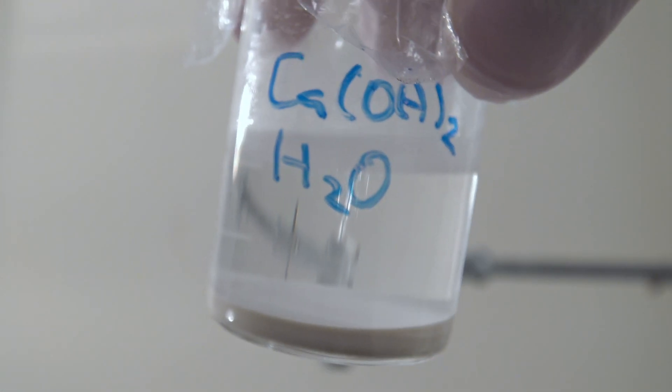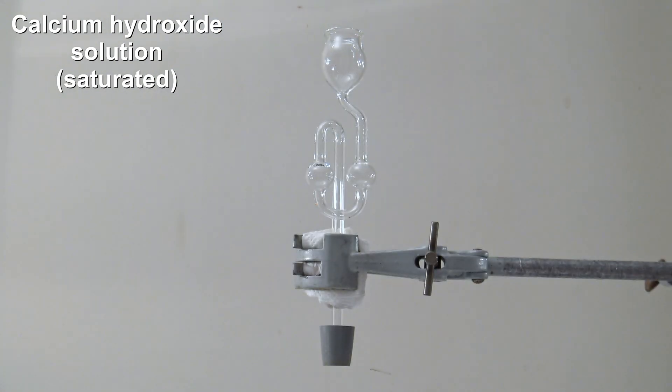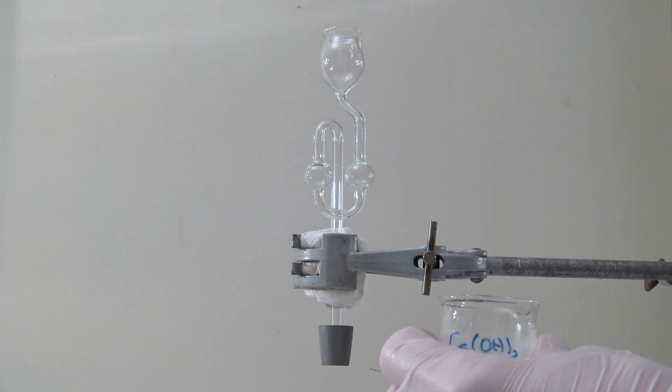For the test, saturated calcium hydroxide solution is filled into a fermentation tube. Barium hydroxide could be used instead.